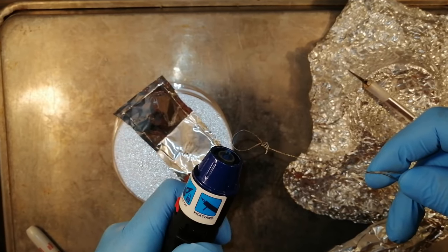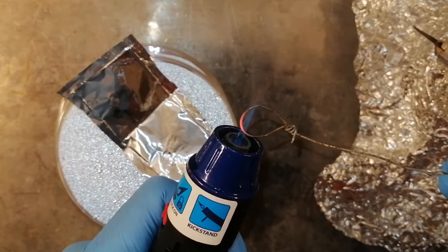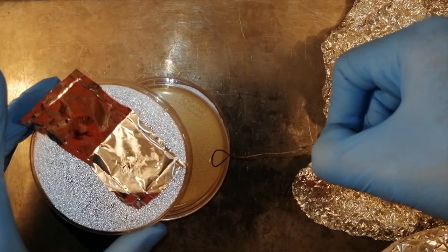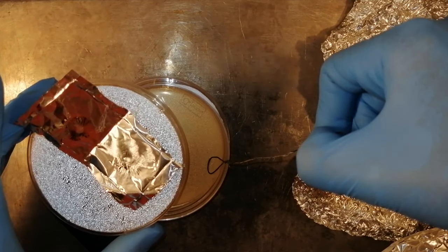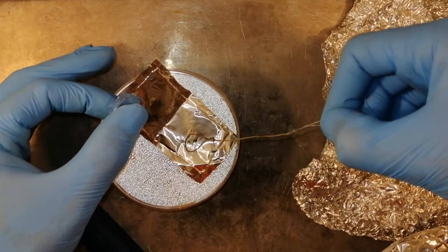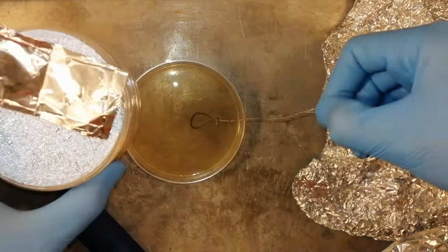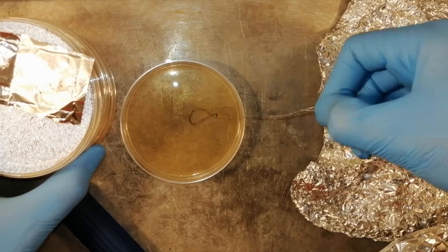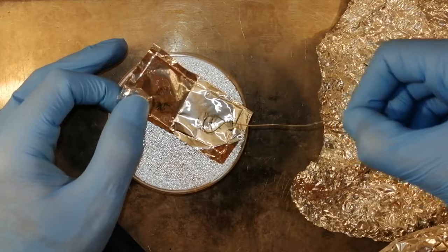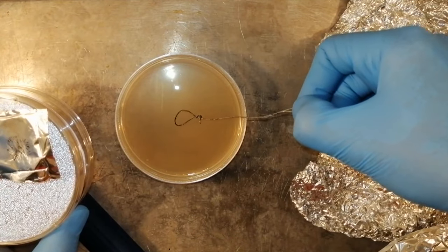Next, take out your inoculating loop and flame sterilize it until it glows orange — I prefer using blue flame lighters, but you can get away with using virtually any flame. After flame sterilizing your inoculating loop, take out a petri dish and briefly dip the hot metal loop into the agar. This will coat the loop with agar and help the spores stick to it. Immediately after that, dip the loop into your pile of spores. Then swipe the very center of the petri dish with the loop in an S or Z pattern, like you are writing the letter on the surface of the agar. It's important to stay in the middle of the plate because the mycelium will grow out from the center, and you will typically only use growth from the outer ring before it reaches the edge of the plate. The outermost growth tends to be the most vigorous and healthy, with some strain isolation even on the first plate.